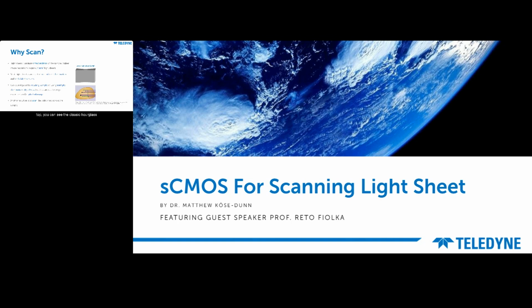On the top you can see the classic hourglass shape of the light sheet in grey, and you can see the artifacts generated in the image as the light sheet propagates from left to right and causes these long purple shadows in the sample. With a technique known as digitally scanned light sheet, or DSLM, which uses more of a pencil beam which is then scanned through the sample, these additional illumination points greatly reduce the artifacts in our image.